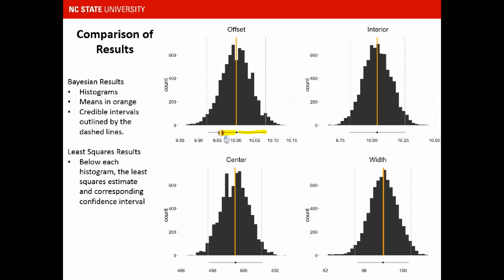This concludes our coverage of peak fitting methods. As we can see from the results of our example peak fit, if we look at the summaries from the Bayesian method, they convey similar information to what we would see from least squares. However, where least squares only provides a single estimate for each alpha, the Bayesian method produces histograms that give insight into ranges of possible values for each alpha. In a subsequent tutorial, we'll cover the Bayesian method and the sampling algorithm in more detail.